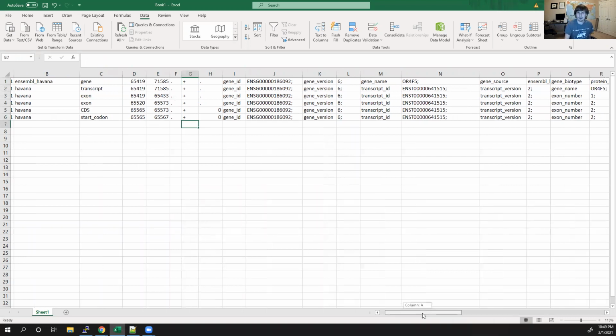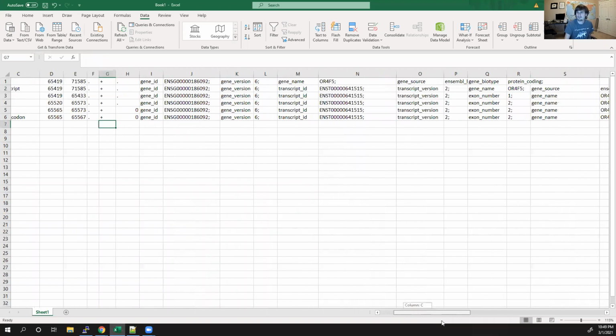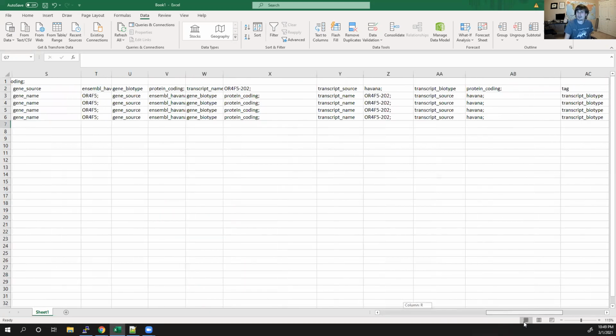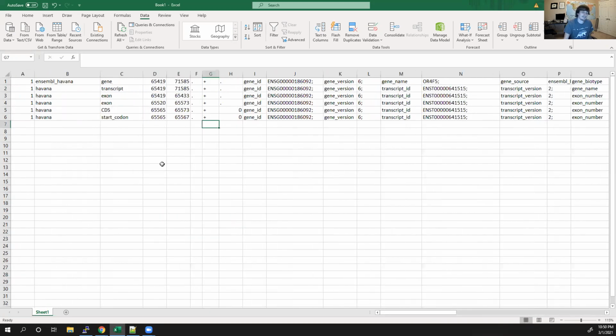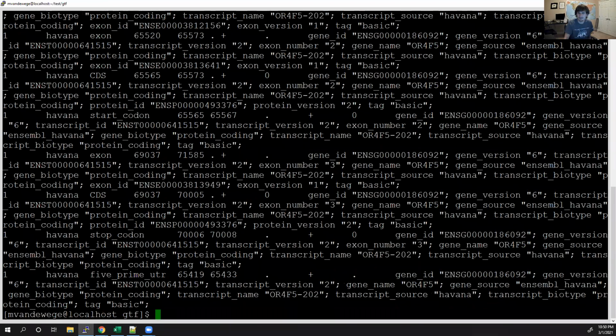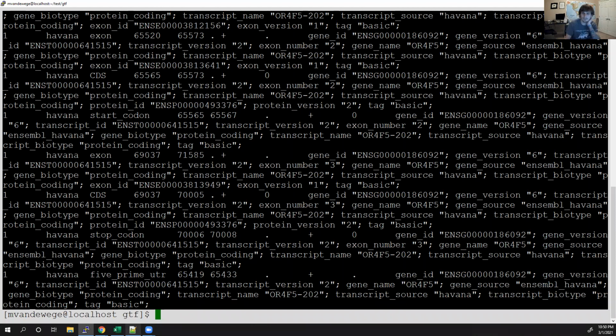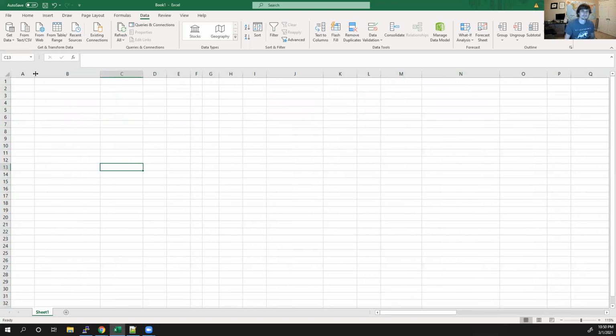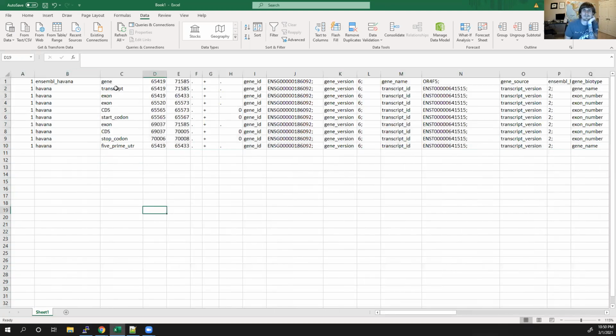It's going to have several variable exons, transcripts, etc. But yeah, since this is a protein coding gene, we also annotate the start codon, like where's the actual start codon. And I bet if we take this even further, we should likely see the stop codon. So let's see if I can highlight all of this and see if we can get the complete information for this protein coding gene. Yep, here's our stop codon.